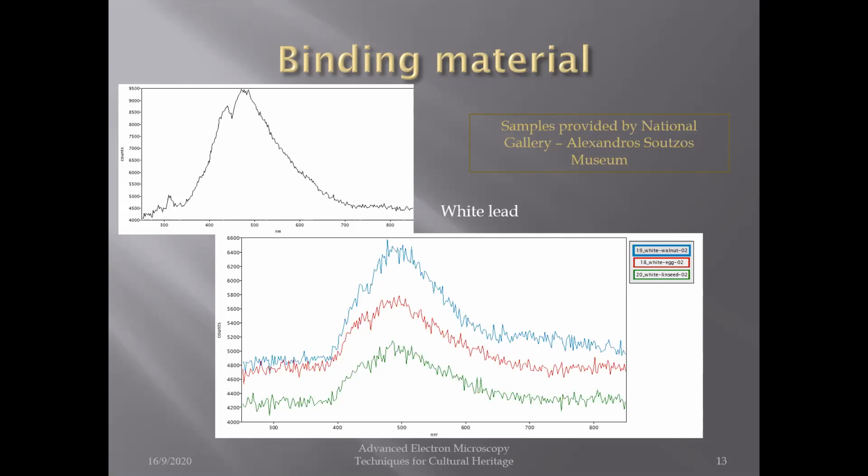Although I have to say that I was a little bit disappointed that we could not also differentiate between the binding materials. However, the fact that our analysis is not affected by the binding material is, of course, very promising. Another test that we are carrying out right now is to see what happens with weathering. However, we do not have any results yet. We will very shortly.